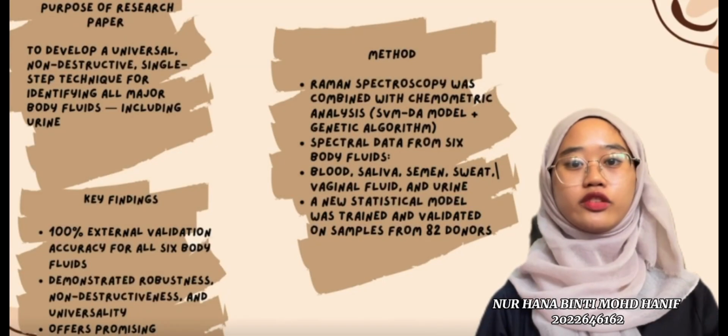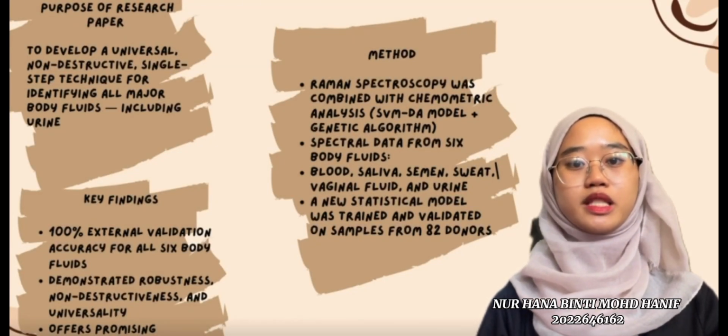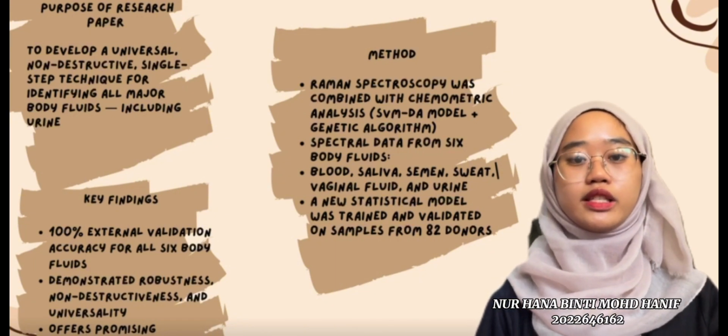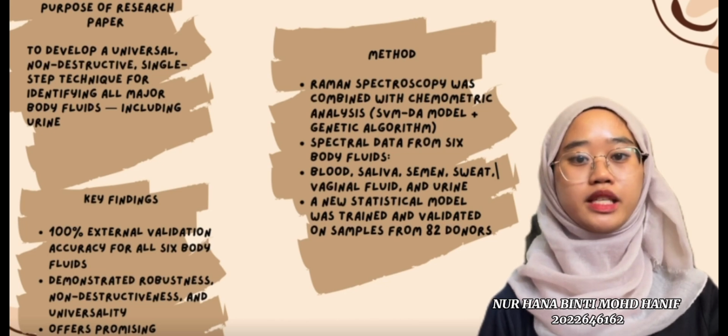This study presents a universal non-destructive method using Raman spectroscopy for identifying 6 major body fluids. The technique achieved 100% validation accuracy on 82 donor samples, highlighting its strong potential for forensic application.